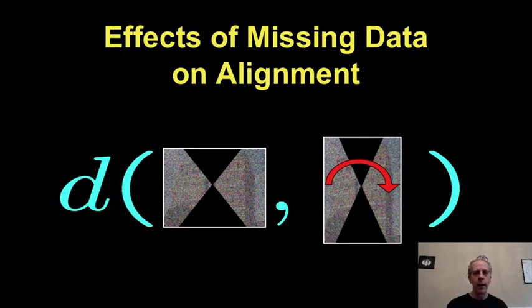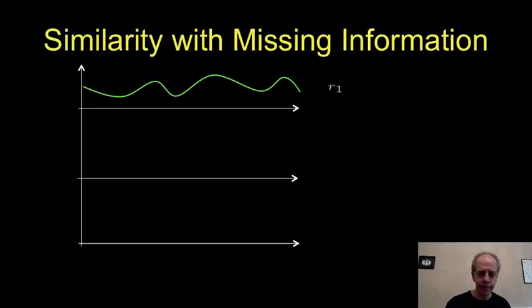That's where you are aligned. So I need to define that distance between two images with robustness to noise and with the missing wedge. So let's illustrate that. That's the first step every time that we need to align images. How do I decide when they are already aligned?